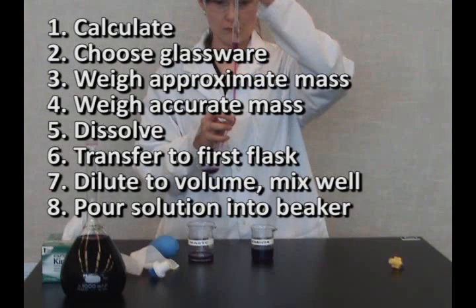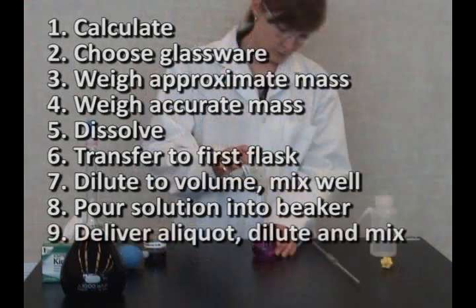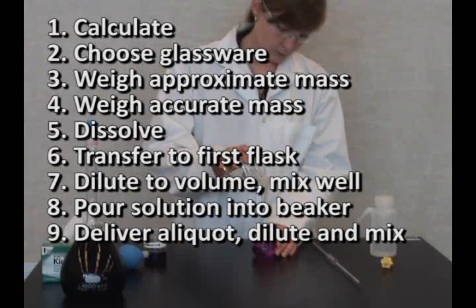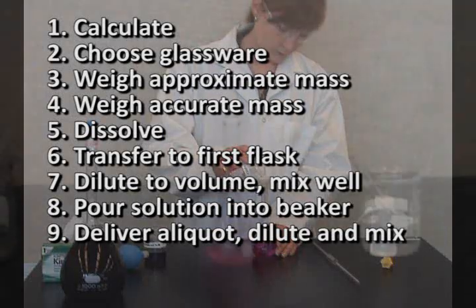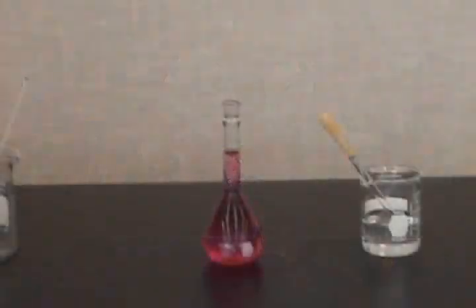Pour some solution into beaker. Take aliquot into pipette, add to second flask, dilute to volume, invert and mix. Now you have your 10 part per million manganese solution.